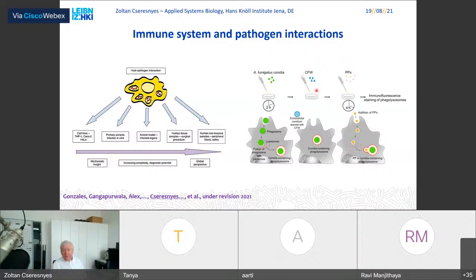And once we have this environment where macrophages had time to engulf the pathogens, and the pathogens have been labeled accordingly, we do the confocal microscopy experiments. What is the concrete goal of such an analysis process? Well, for example, it is to monitor how well the macrophages function, as I mentioned, but not just that, it's also the goal to figure out how we can help the macrophages do their task.